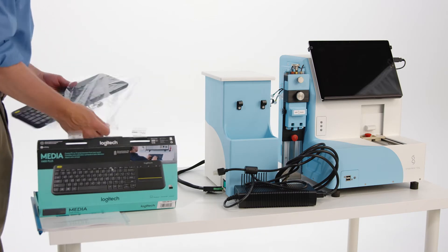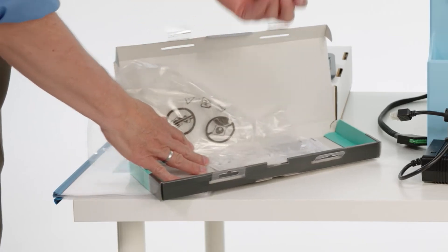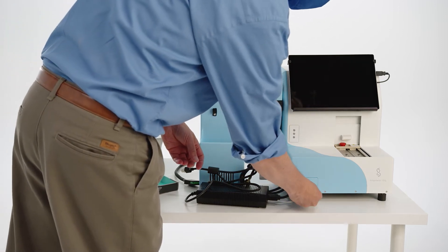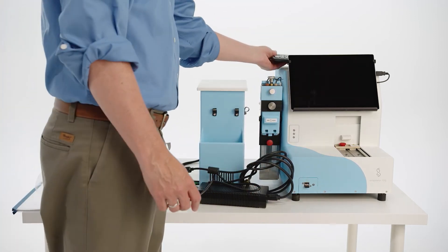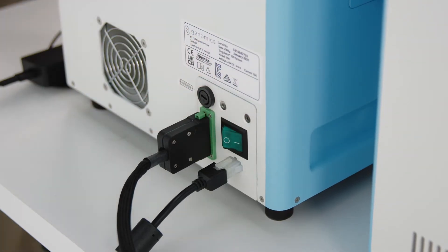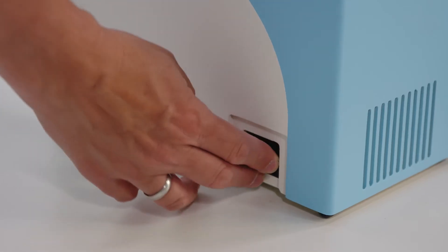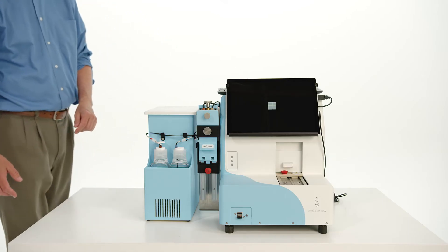Open the box for the USB keyboard. Remove the Bluetooth USB adapter from the keyboard box and insert in one of the USB slots on the front of the Singulator. Turn on the keyboard and place next to or on top of the Singulator. Plug the tablet computer and Singulator into their electrical outlets. Turn on the Singulator using the toggle switch on the rear of the instrument. Turn on the chiller unit using the toggle switch on the side of the chiller. Power on the tablet computer using the power button on top of the tablet.